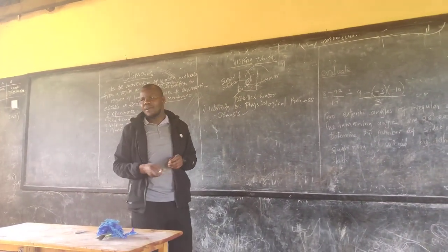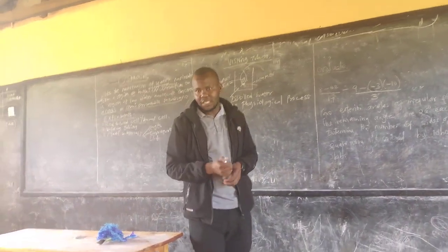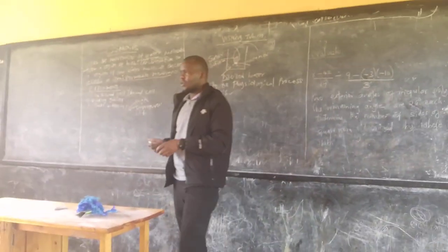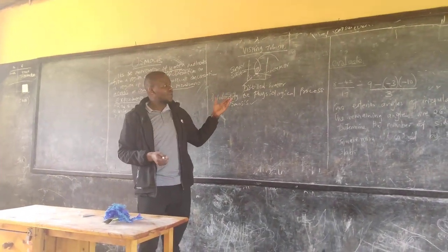Then you do your experiment for how long? Approximately 30 minutes. This is a practical question, right? It will be an academic question. So you leave it for around 30 minutes so that osmosis will have taken place within that time.